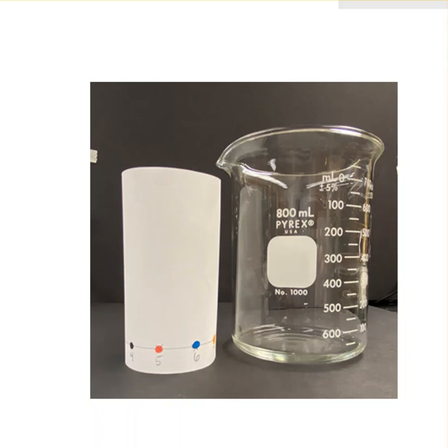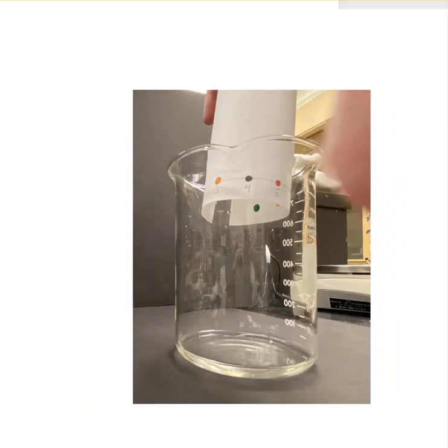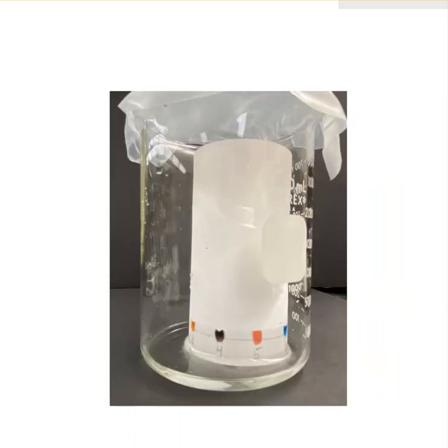After we get our dyes on the paper, we roll our paper up so it'll fit into the beaker, and then we put our eluting solution down here in the beaker. We don't want too much because when we put the paper in, we want the liquid level to be below the spots. Otherwise, the dyes will just go down into the bottom of the beaker. So once we have the right amount of eluting solution in here, we're going to put our chromatography paper in. We put a cover on it so that it doesn't evaporate too much.